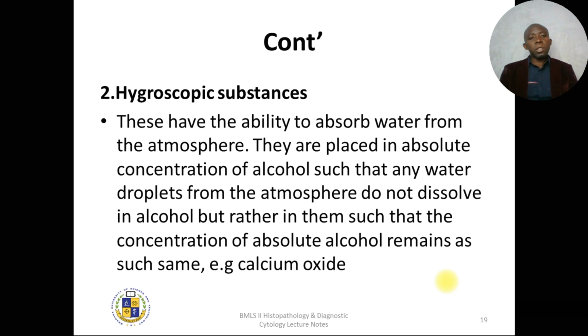So another additive which you can actually use during dehydration are hygroscopic substances, and these have the ability to absorb water. If you remember the hygroscopic substances in our basic science, we studied from the different levels. So these absorb water from the atmosphere.